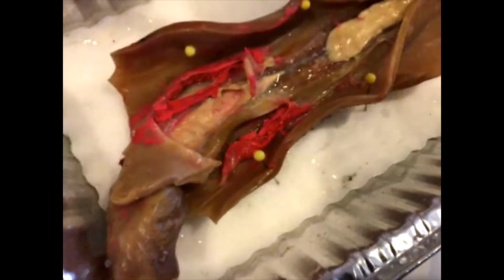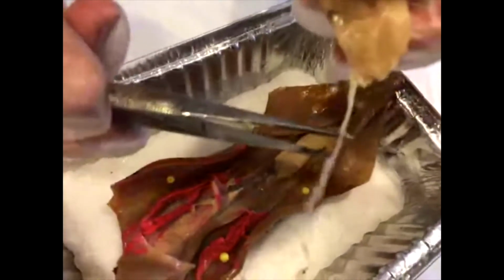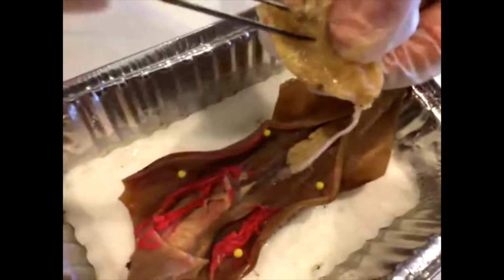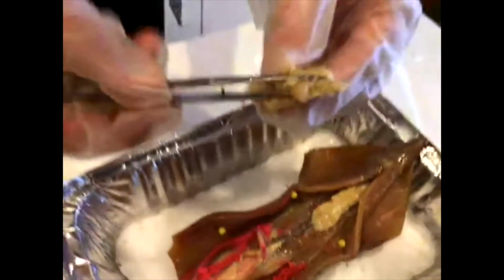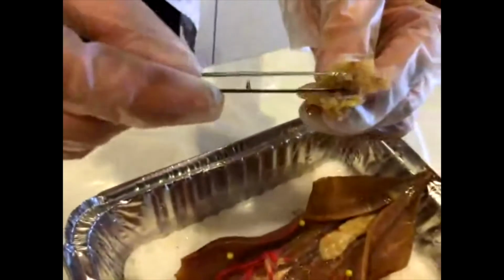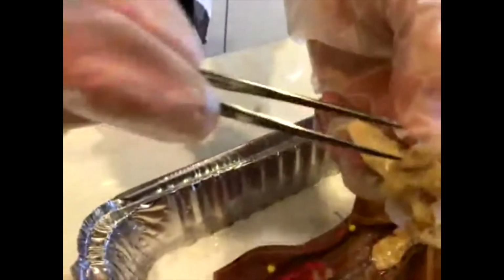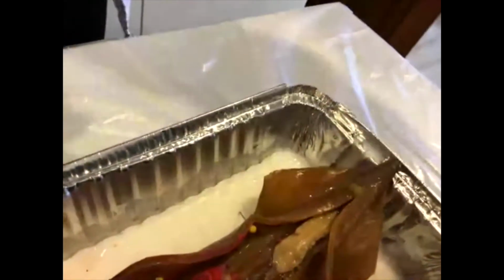Yeah, and you can see that there is this line. That's the rest of its esophagus. So that was attached to the mouth part, the beak that we opened up earlier. And the stomach is quite hard. Let's see if there's anything visible in here. Kind of, there's little bones in here. Not sure if you guys can tell, but it's quite hard. And those are just tiny, tiny little bones. So this guy probably ate some kind of fish, maybe an anchovy or a sardine, something small.